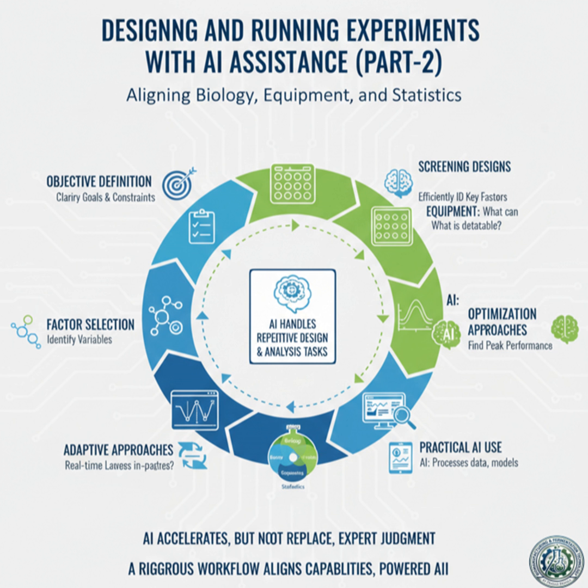Select factors that are mechanistically meaningful and operationally controllable. Define ranges that capture nonlinearity without crossing into oxygen limitation, toxicity, precipitation, or culture failure regimes. Use screening designs to identify major drivers quickly, not to optimize. Be aware of aliasing, curvature blindness, and survivor bias from failed fermentation runs. Shift to response surface designs such as CCD or Box-Behnken when curvature matters. Recognize that biological optima are local and regime dependent, especially when scale changes shift mass transfer realities.